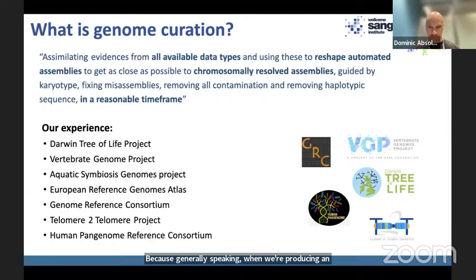And sometimes we can retain two copies of stuff in that single haplotype assembly, which is less than desirable. So we try and remove that. And the last little phrase at the end there is in a reasonable time frame.